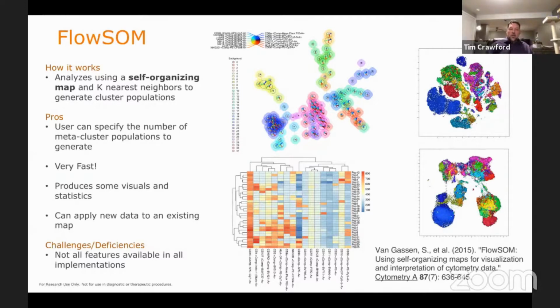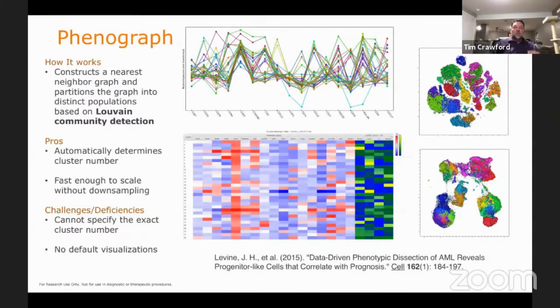those clusters. Not all the features are available in every implementation in commercial packages, so you can't do everything you can do in R, but this has been a really useful tool, and we can see that in the number of publications and how many people are interested in employing it because they're starting to see it be used in their favorite journals. The other algorithm that I am really excited about is Phenograph.